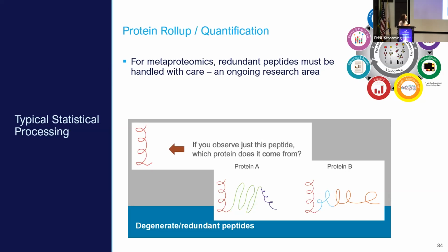A note about the protein quantification step in metaproteomics. Here we have the added complexity of multiple organisms in our sample. So this explodes the difficulty of doing protein quantification. And this is an ongoing research area. There are some methods out there, but it's still constantly developing.